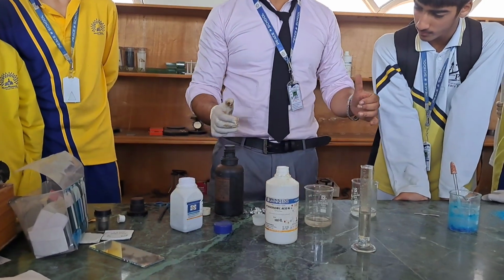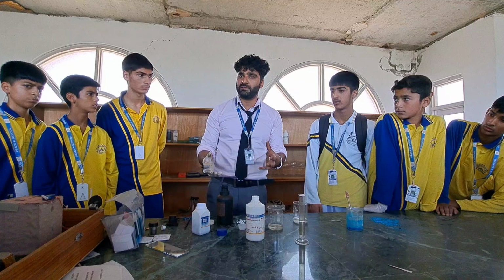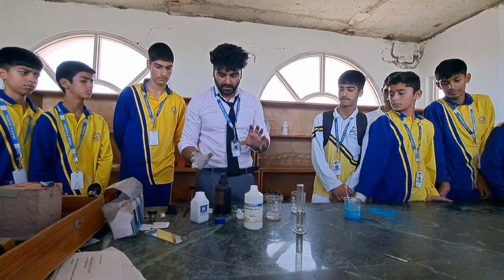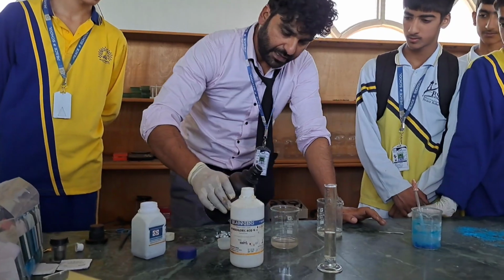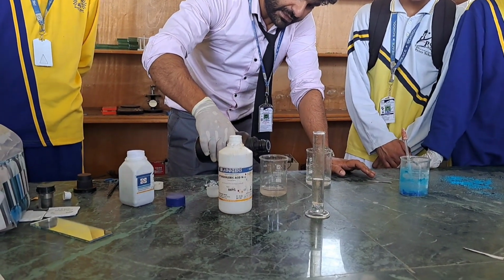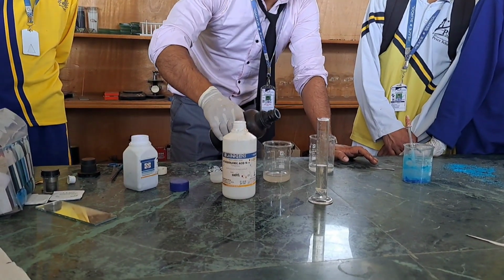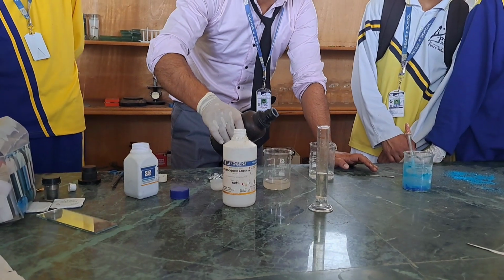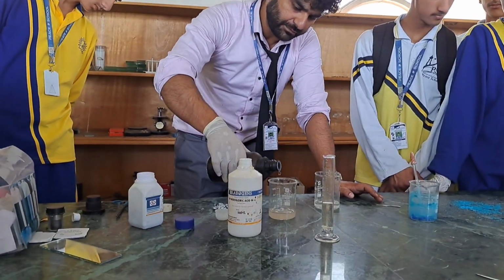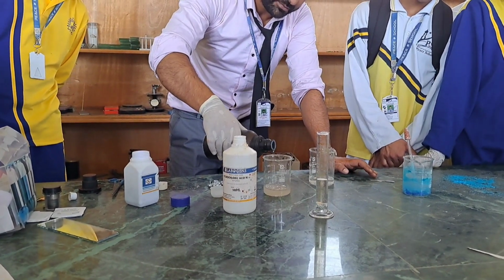In dealing with these acids, we have to be very cautious. In handling such bottles which contain such kind of acids, we have to wear these gloves, and we have to be very careful in dealing with such experiments. I am pouring some sulfuric acid into it, and this reaction is also, listen, highly exothermic. When acid is put into water, a reaction takes place, and this reaction is highly exothermic. Look, heat is produced.